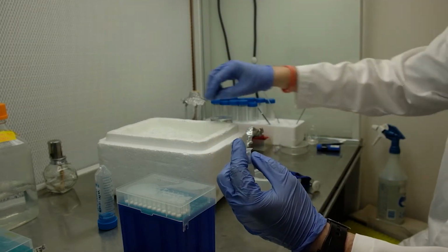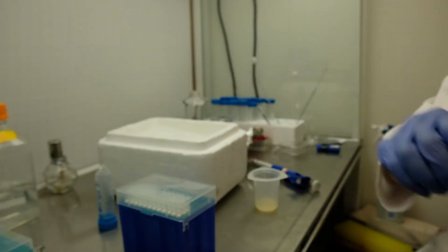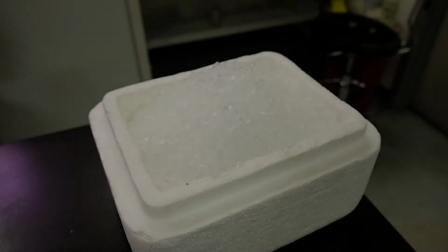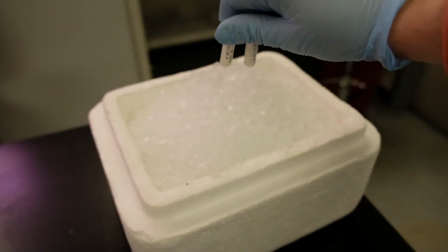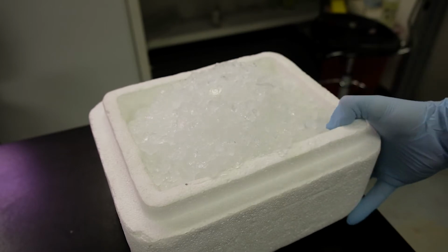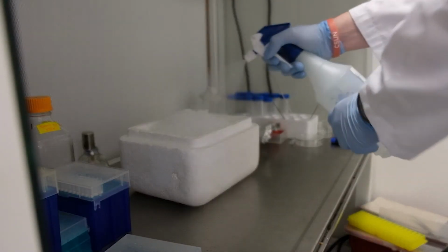And now your competent cells are ready to be placed in the -80 freezer for storage. Make sure to properly label your cryocultures. Get your samples from the -80 like before and make sure to keep them on ice. Once again, ensure sterile conditions.